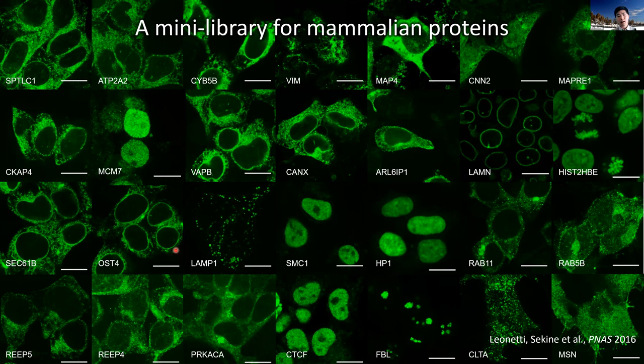And that is, in fact, an even higher success rate compared to the yeast GFP library effort. Now, the ones that were not successful, the majority of them are expressing at a level below the FACS detection limit, because we can plate the unsorted cells and see a fractional population of cells containing the correct signal.